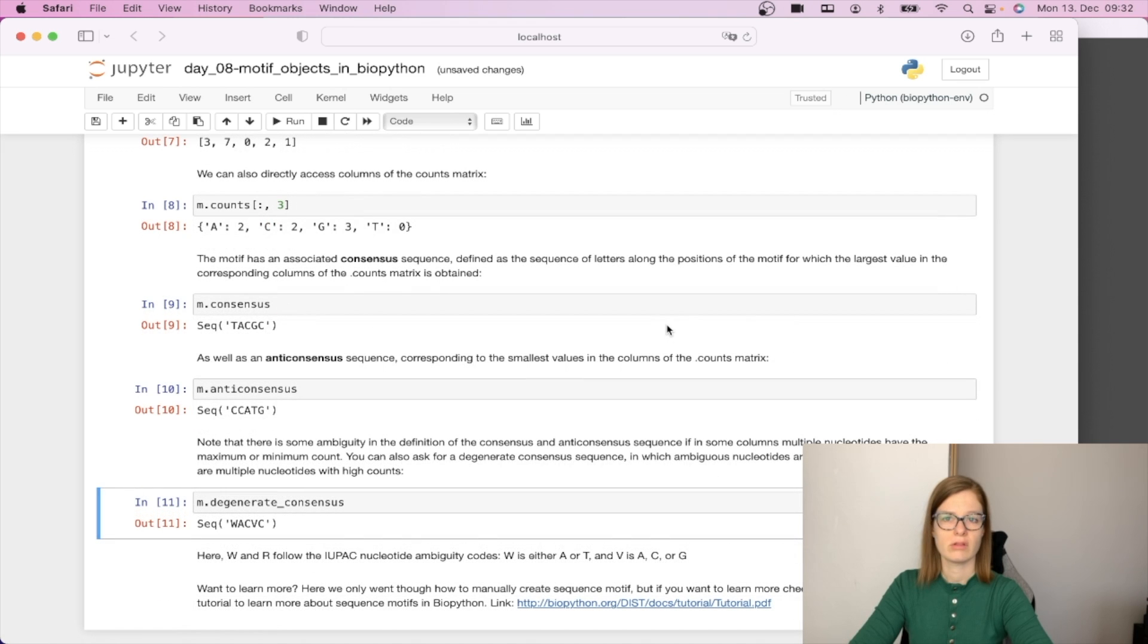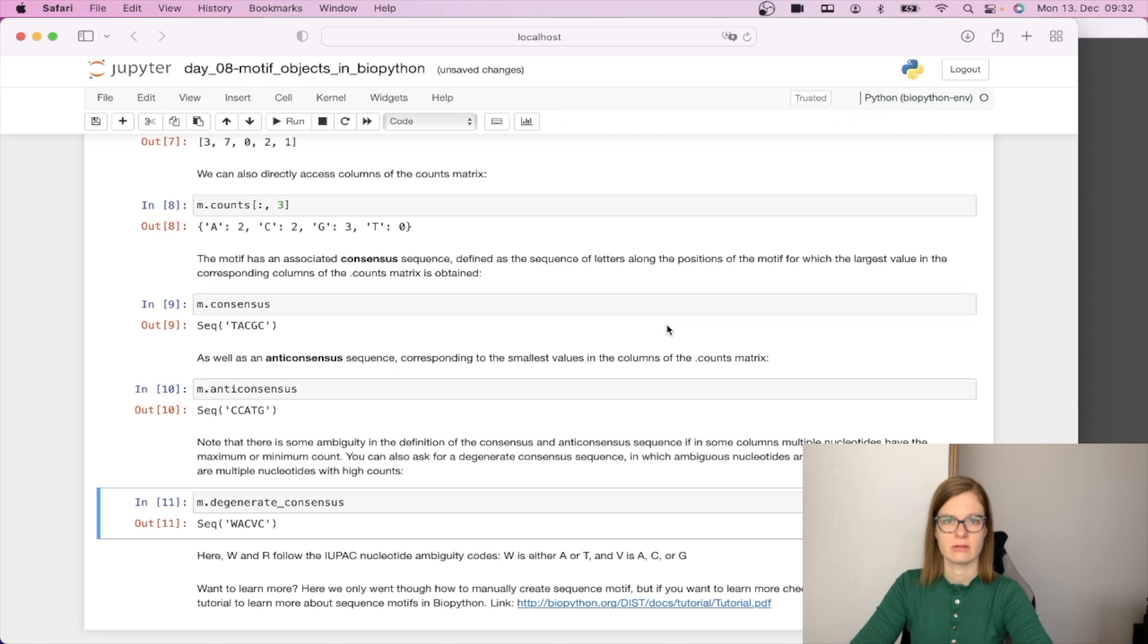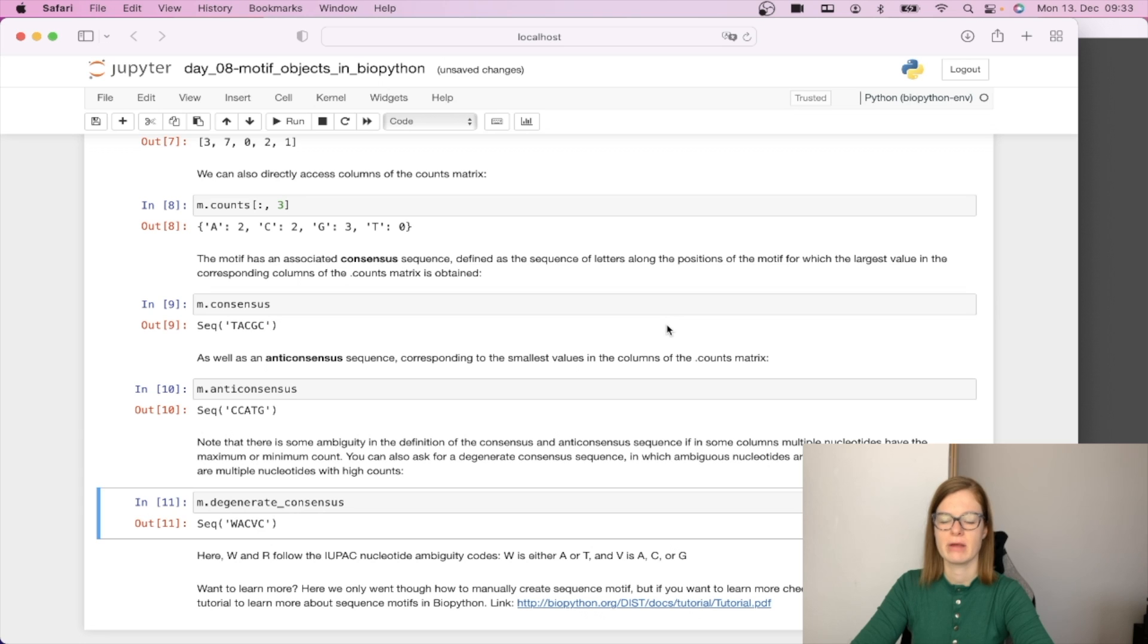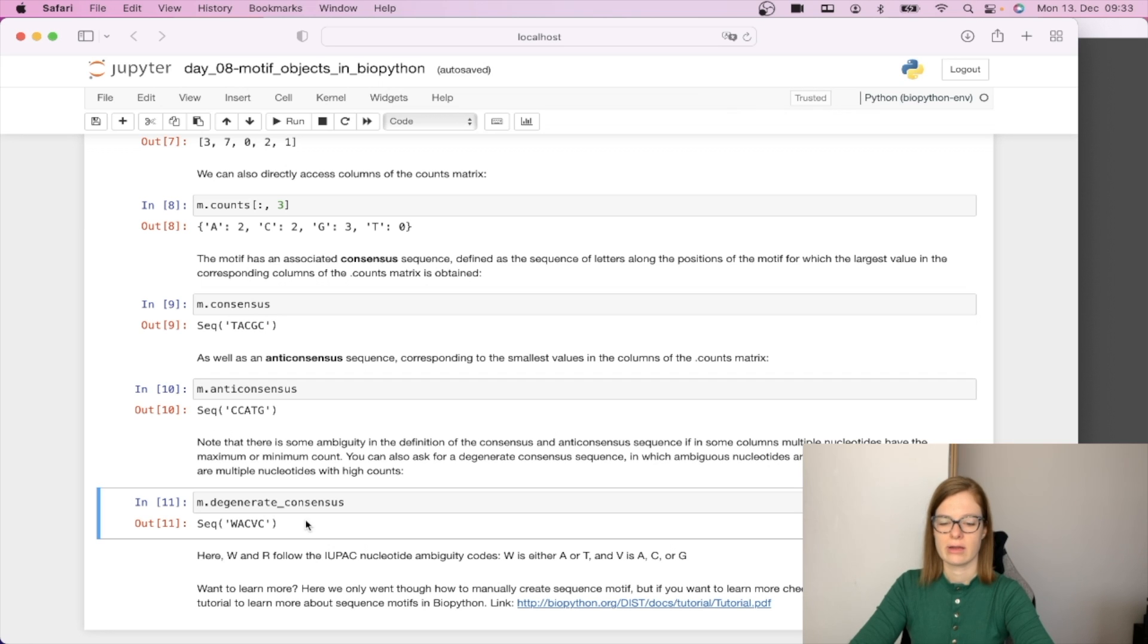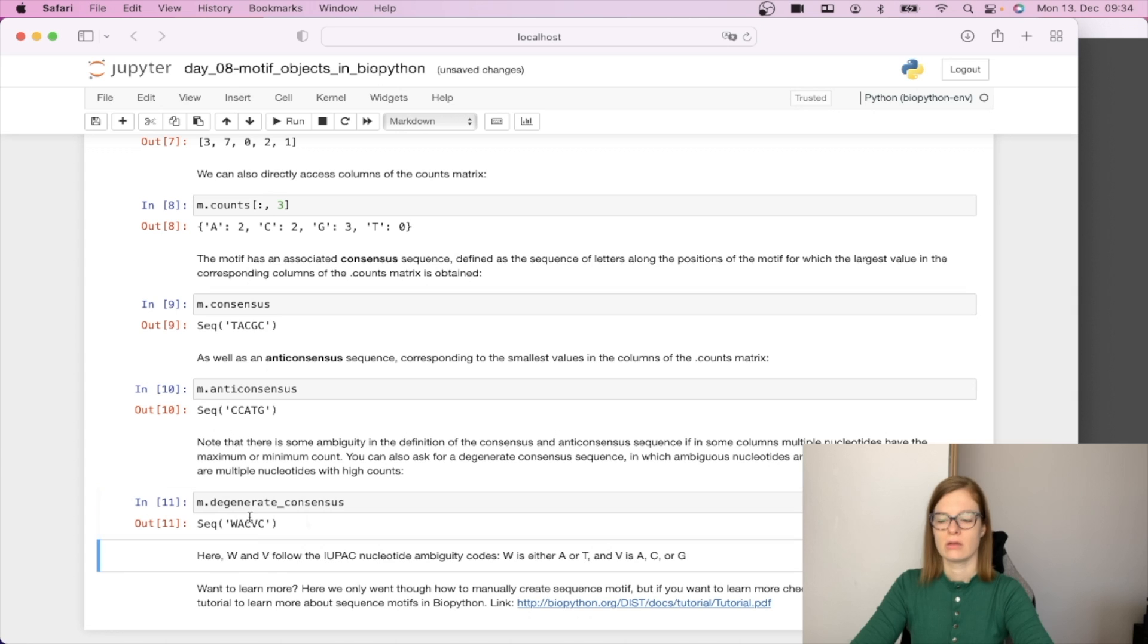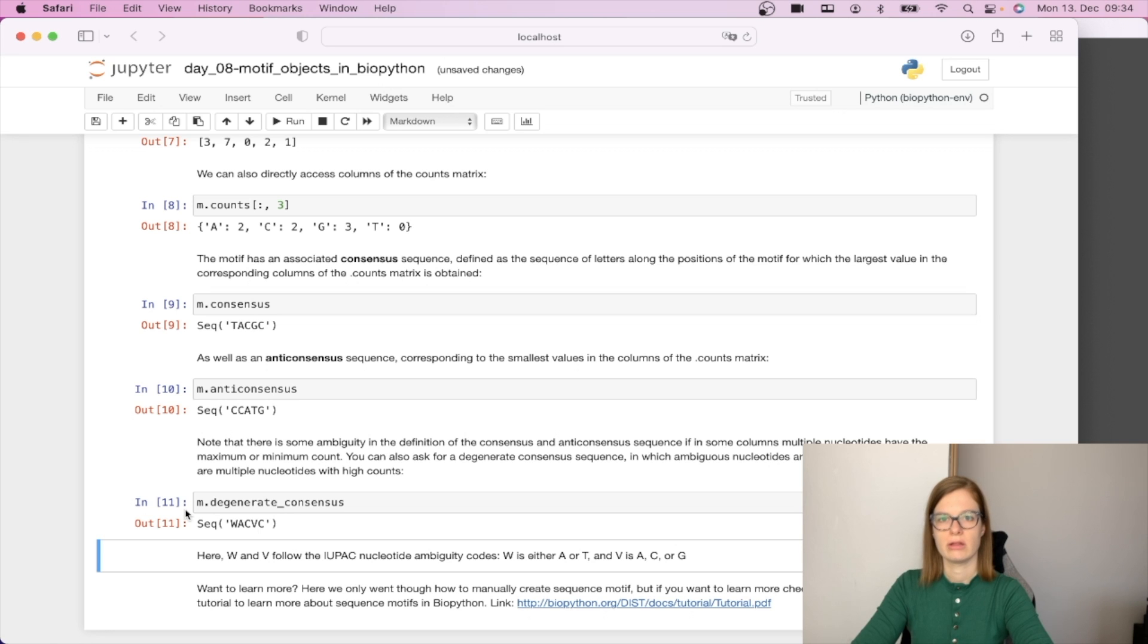It is also possible that we get some ambiguity in the definitions of consensus and anti-consensus. This can occur if in some columns multiple nucleotides have the maximum or minimum count. For this case we can call m.degenerate_consensus in which ambiguous nucleotides are used for positions where there are multiple nucleotides with high counts. Here W and V follow the IUPAC nucleotide ambiguity codes, so W is either A or T and V is either A, C or G.